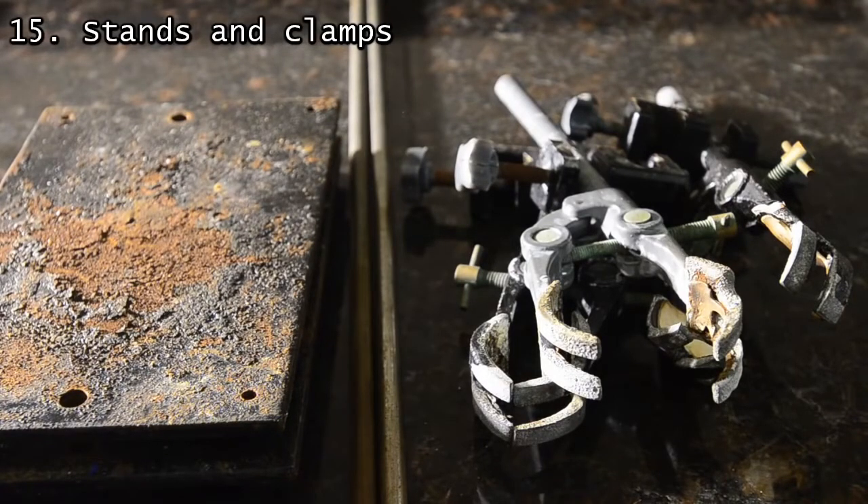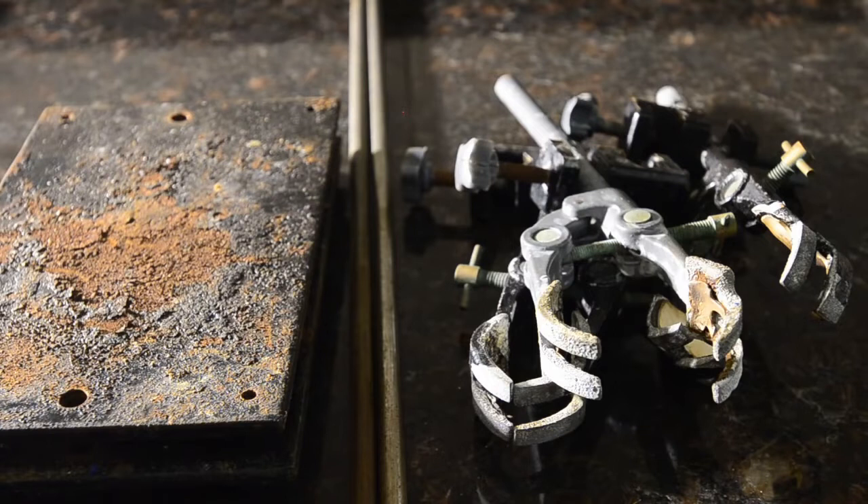Ours are second-hand and very worn out, but still do the job well. We recommend two bases, two poles, and at least three clamps. Try to find at least one clamp where the grip can extend all the way down to holding a thermometer — many stop short of this and so aren't as useful.